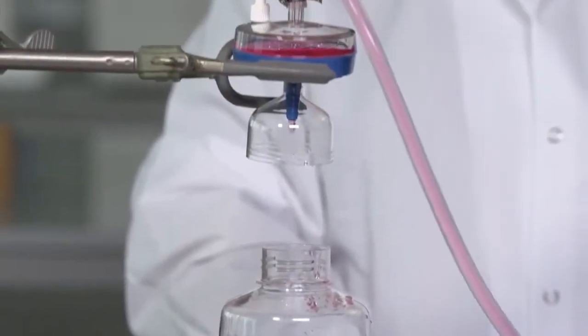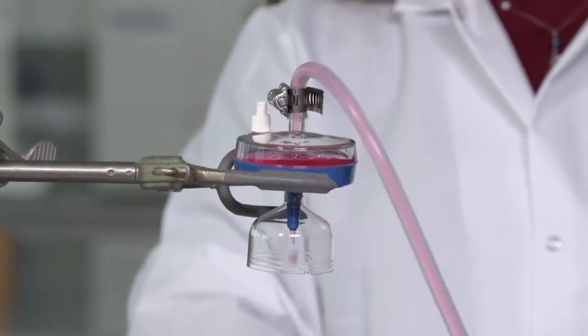When done, turn off the pump. Remove and discard the Steripak GP filter and dispose of properly.